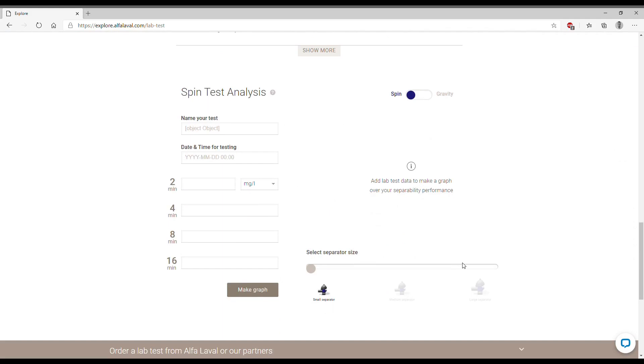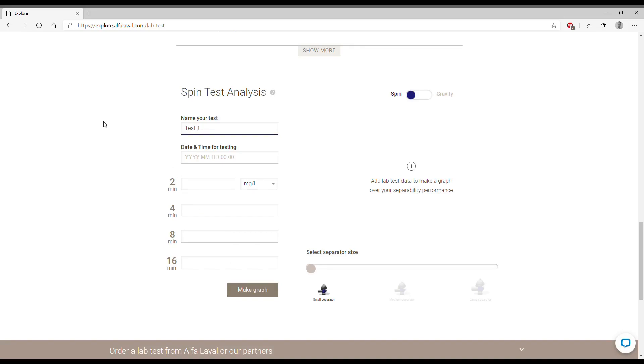In this part we will enter all the results from the chemical analysis starting easily from the name of your test, which can be for example test one, the date so let's assume the second of December 2020 and also we can enter the time so 14 o'clock.